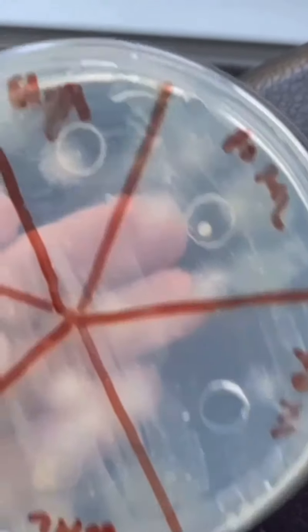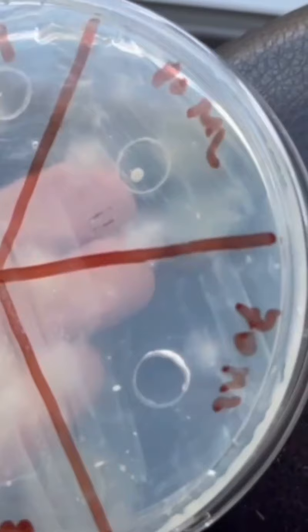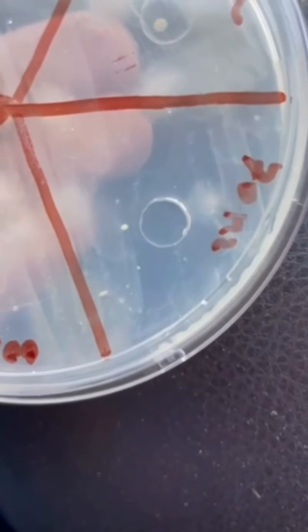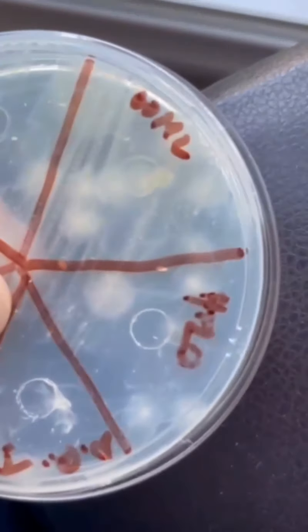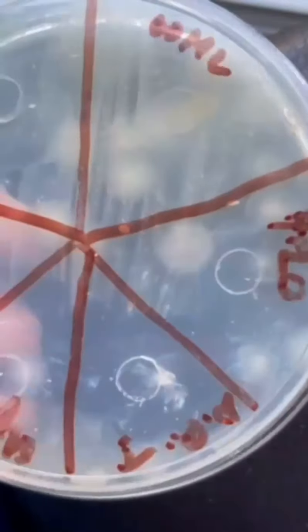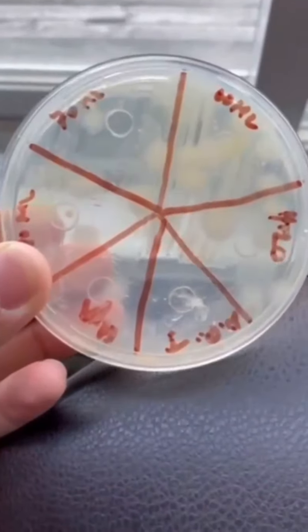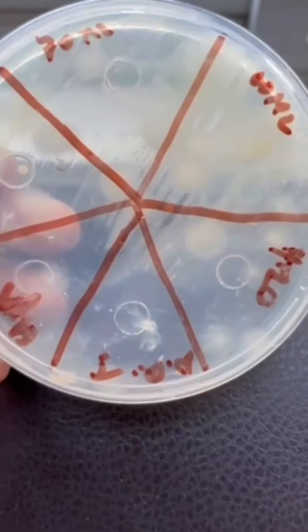For the 80 ml there's only one little dot, but it's under the punching, and on the 70 ml there's nothing. So on the 60 ml side there's growth, on the H2O side there's growth, and on the without active ingredient there's growth. So there's growth on 4 quadrants, except 80, market made, and 70. So my final result is almost complete. This is the last video.